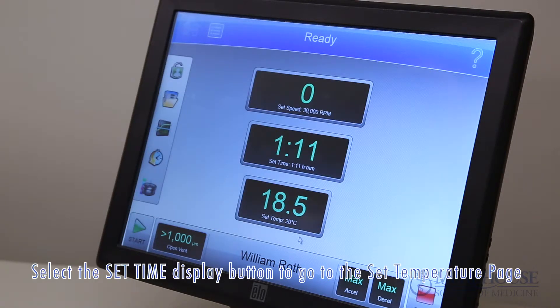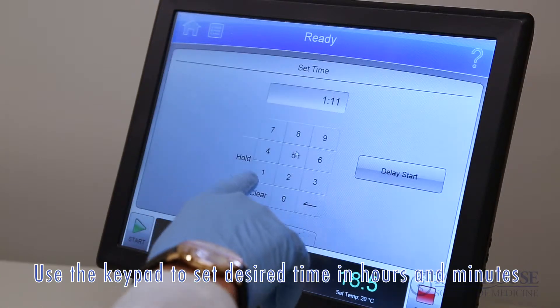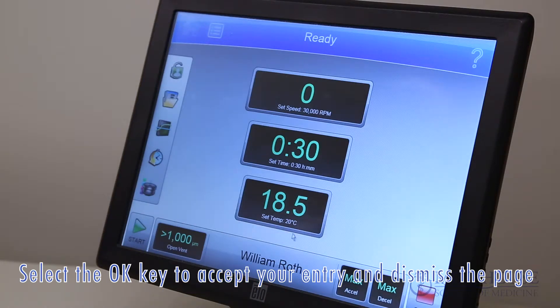Select the set time display button to go to the set time page. Use the keypad to set the desired time in hours and minutes, then select the OK key to accept your entry and dismiss the page.